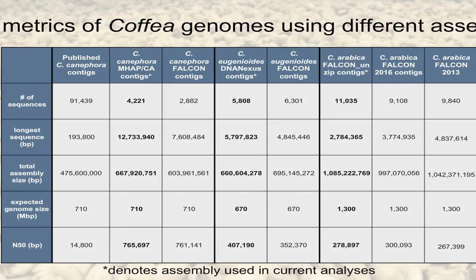And then we sent these off to Dovetail for Hi-C, and then we filled them in with PBJelly and the original PacBio reads.